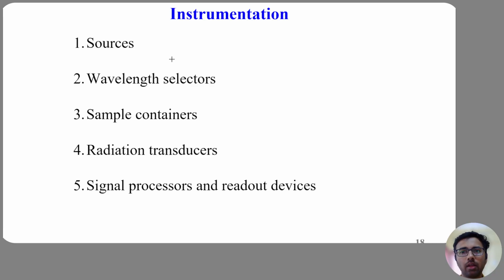We now move from theoretical physics to experimental physics. In science, understanding theory is only half the journey, and the other half is measurement. And measurement requires instruments. Our central question today is, how do we physically measure absorption? How does an abstract quantum transition become a numerical spectrum displayed on a computer screen? The answer lies in the architecture of the analytical spectrophotometer.